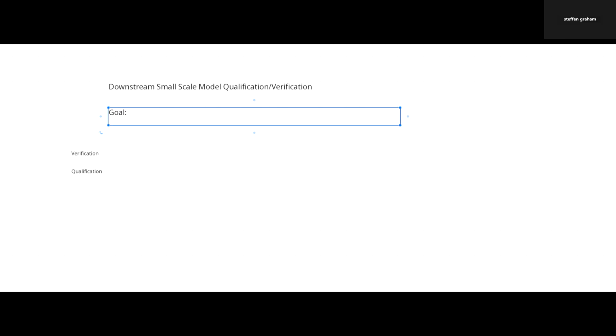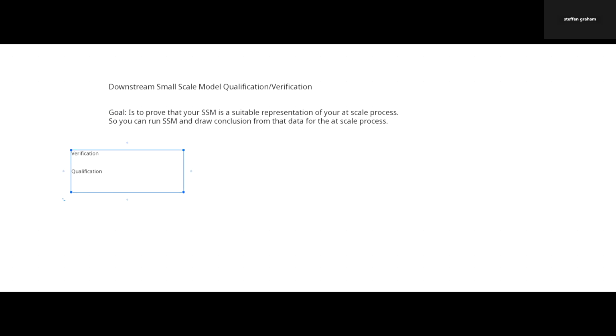It's important for process characterization, where you might start to define parameters as critical process parameters, CPPs, or key process parameters, KPPs, if you use that term. I know not everyone does. Had companies where we did use KPP and others where we didn't. And then eventually, this will roll into or help define a control strategy. So, it's definitely important.